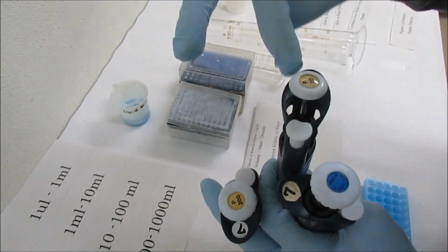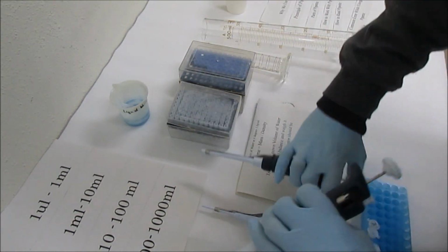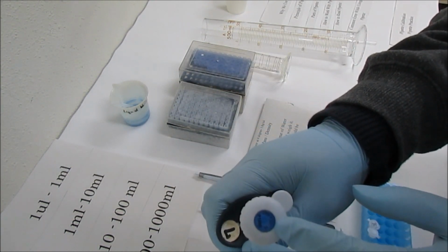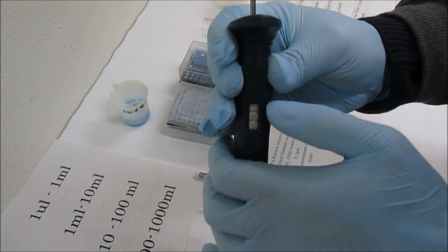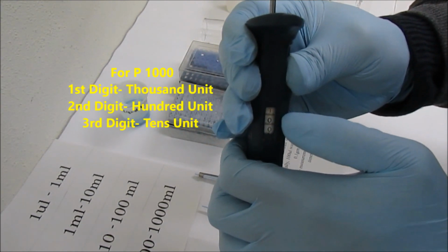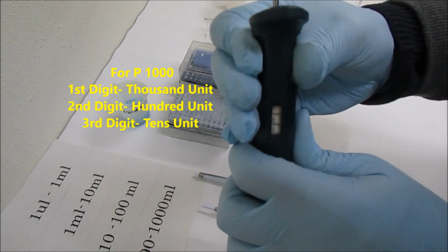This represents the maximum volume of the pipettes. Here it's written 1000, which means 1000 microliters is the maximum we can use. The first digit refers to the 1000s, the second digit refers to the 100s, and the third digit refers to the 10s. So now this is 1000, right?